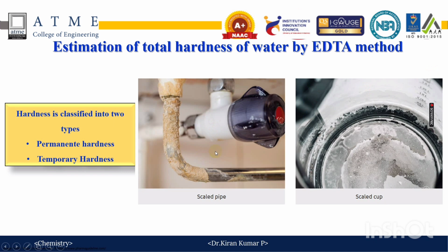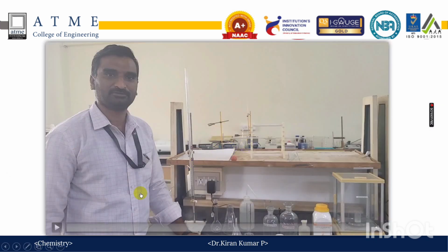So these are the drawbacks that are caused due to excess of hardness in water. Let us have a demonstration of total hardness of water.